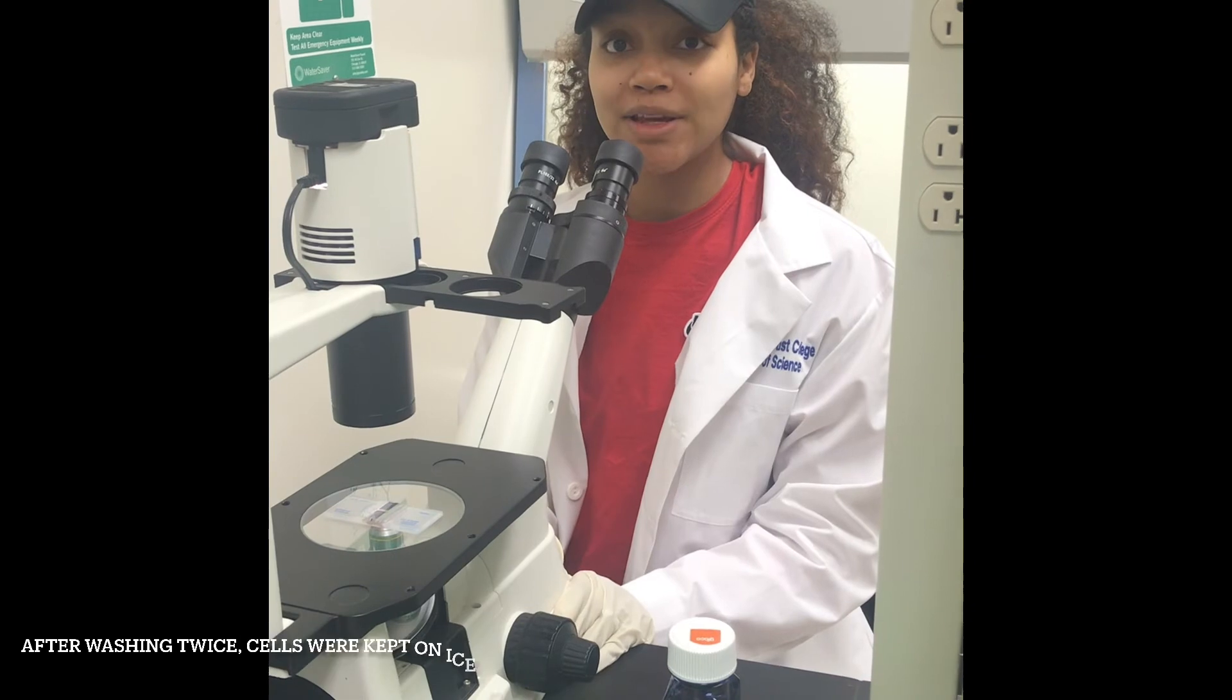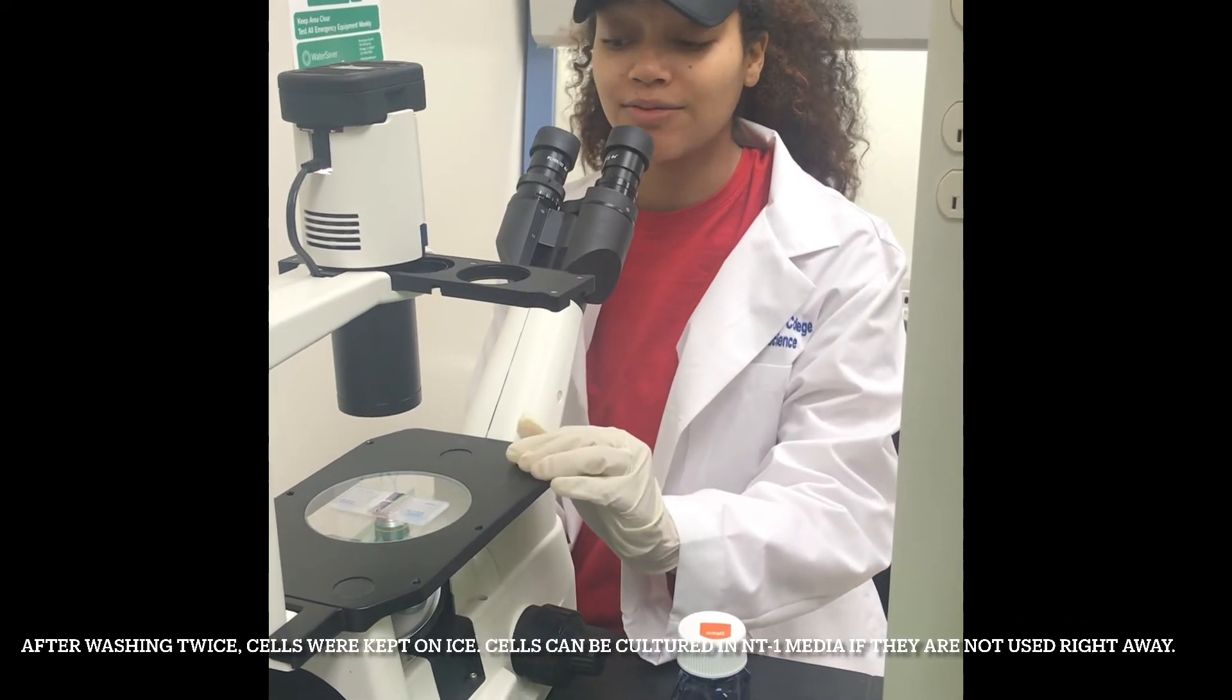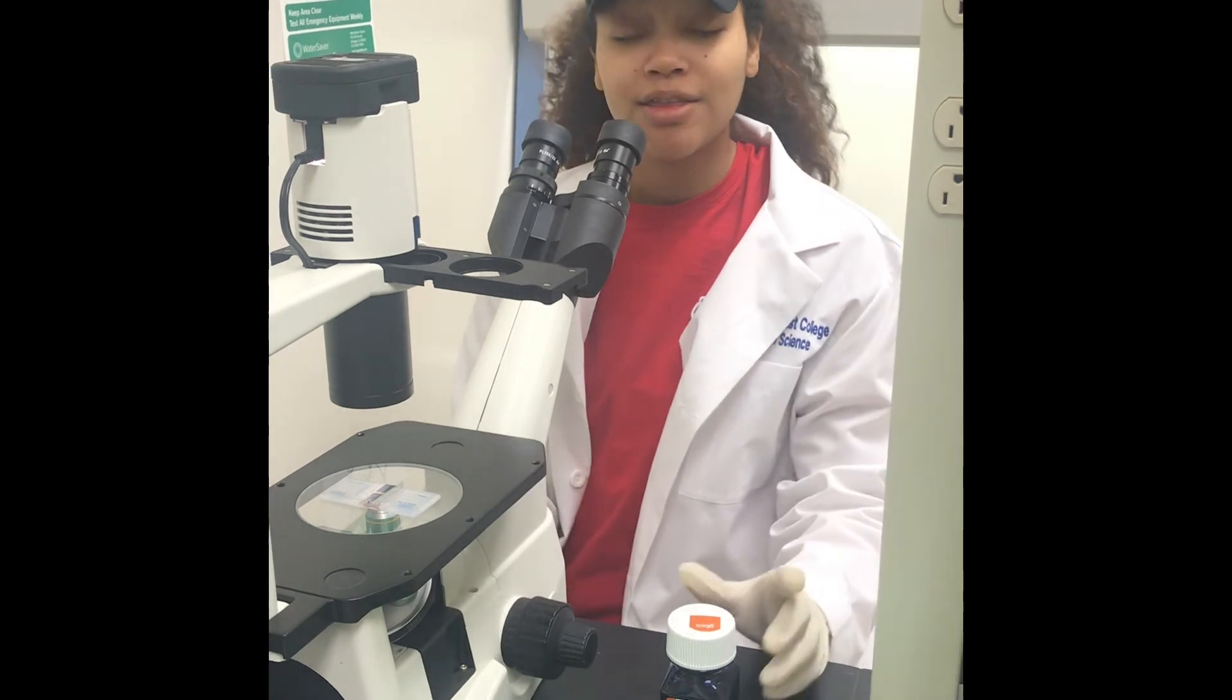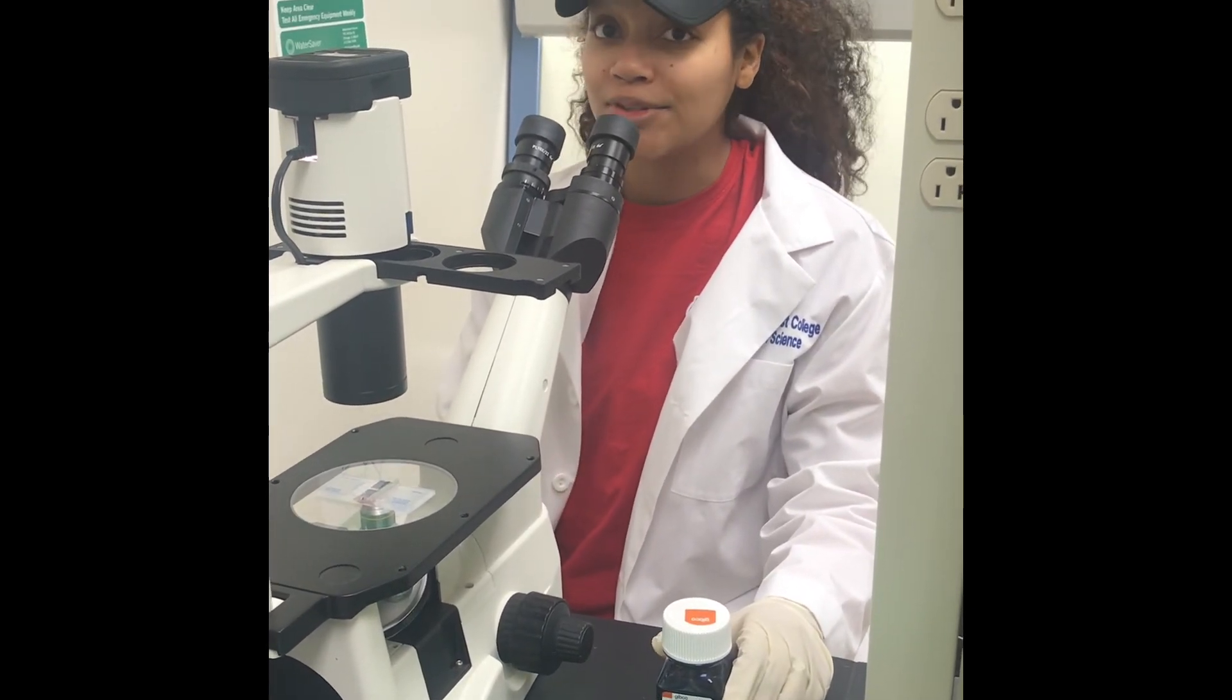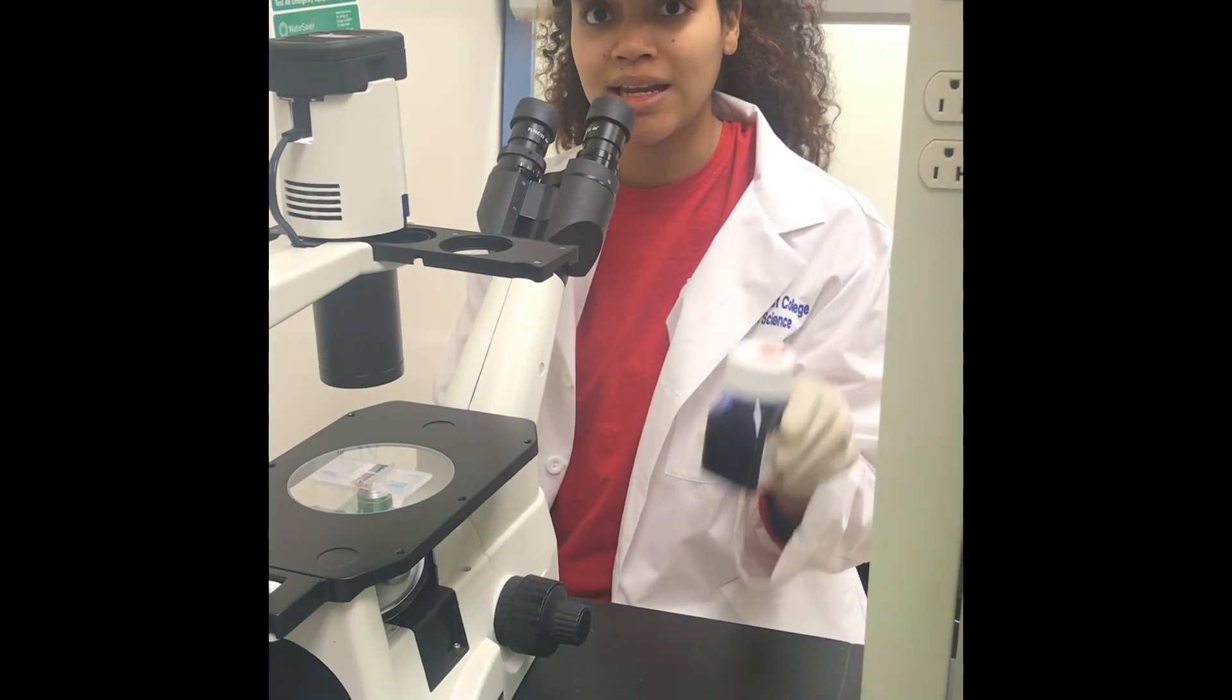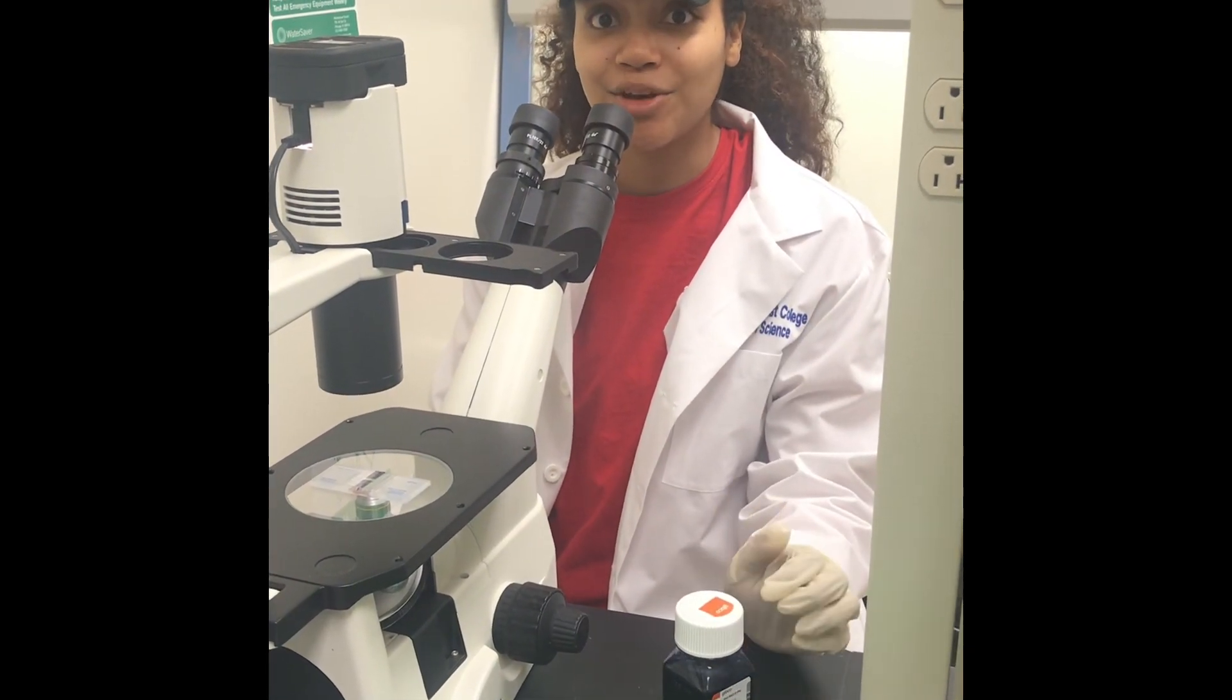So now I will use my light microscope to count the viable and non-viable cells in my hemocytometer. The viable cells will appear clear and the non-viable cells will appear blue because the trypan blue stain penetrates the cell membrane of the dead cells.